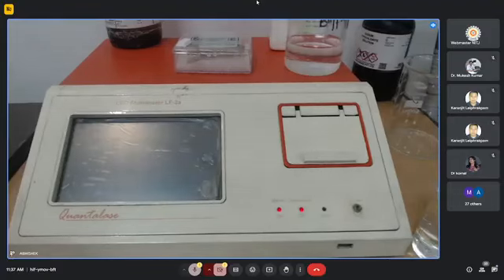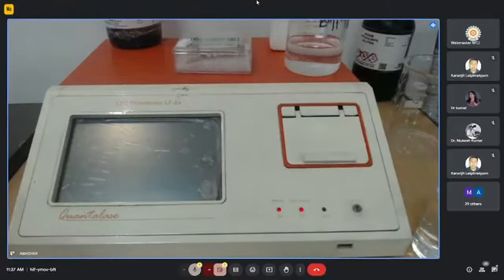The working principle of this instrument is based on fluorescence of uranium complexes. On excitation with UV light of suitable wavelength, the uranium complexes emit green light, which can be measured by a sensitive photomultiplier tube. Since the fluorescence yield is proportional to the intensity of the excitation source and the concentration of uranium in the sample, the measurement of fluorescence gives the information about the uranium concentration in the sample.